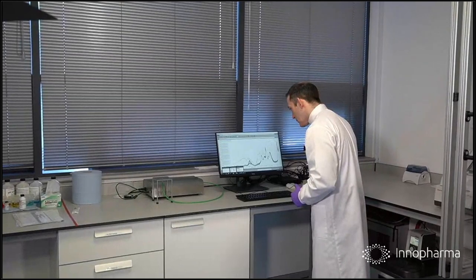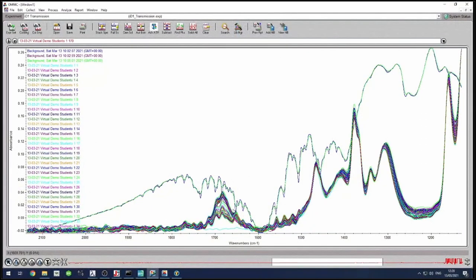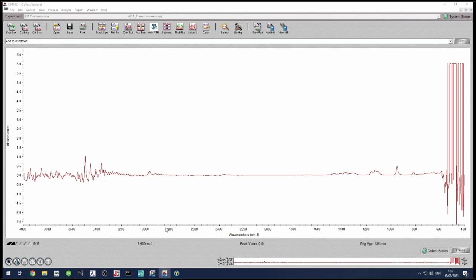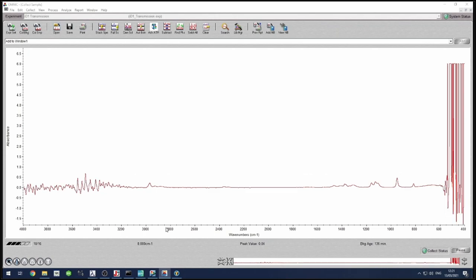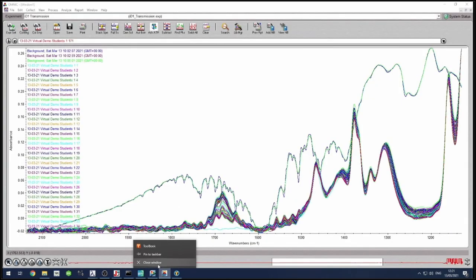So, what I want us to look at is here. Before we look at the actual chemometrics next, what I want you to see here is how, for much of this FTIR spectrum, nothing significant changed. There were some fluctuations. Unfortunately, we've lost the overlay. But what you could see there, and what you'll see building up here again, is that for much of the experiment there was no real change, only slight fluctuations across a lot of the wavelengths. But at certain peaks, you can see there is distinct activity. And these are the peaks that we would select on.